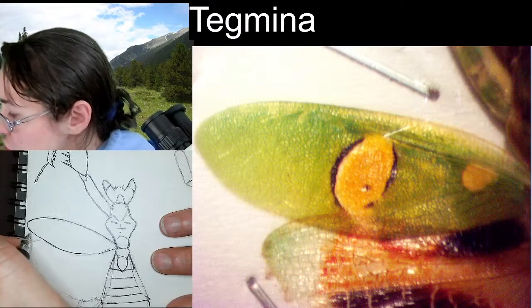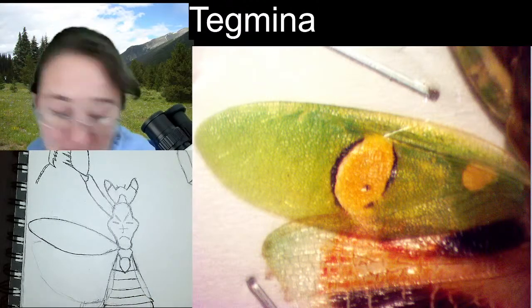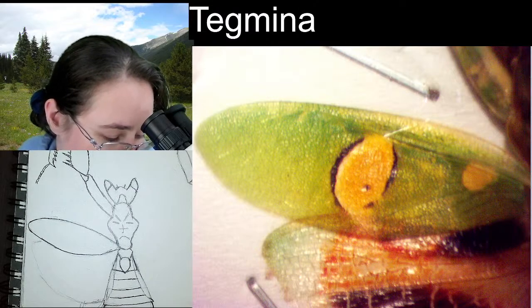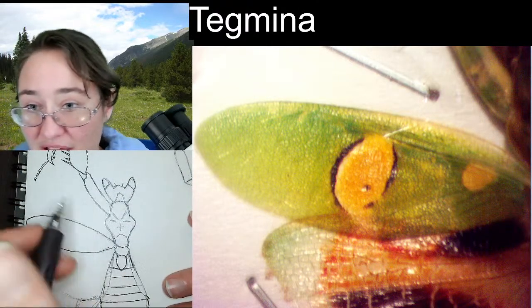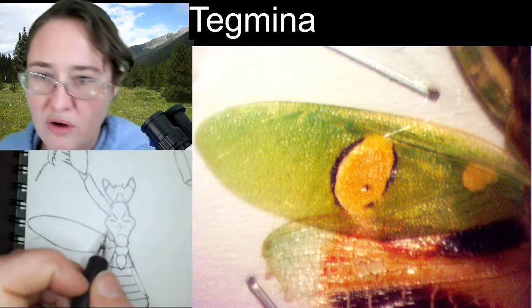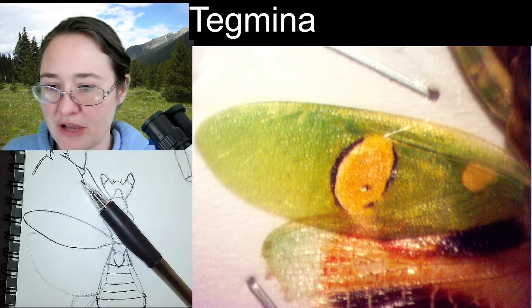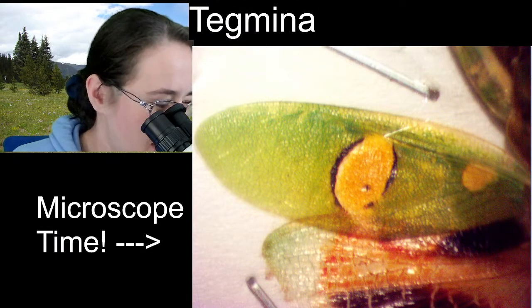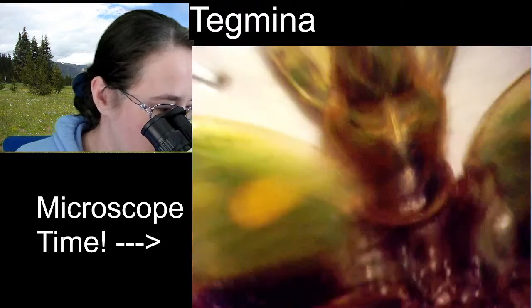All right, the jeweled flower mantis has eye spots, ladies and gentlemen. These eye spots on the front wings are used as a defense. There is also one vein that I want to point out to you, and I'm going to move the microscope just a skosh, just a little bit, because I want to show you where this vein connects and why it's important.